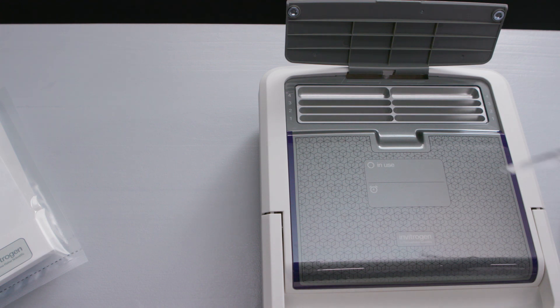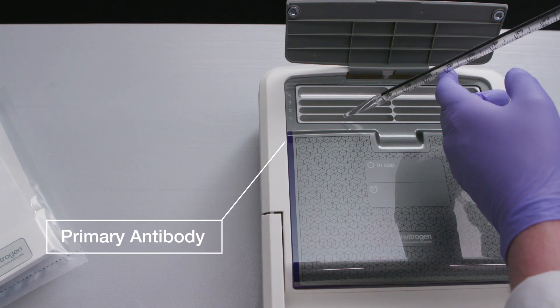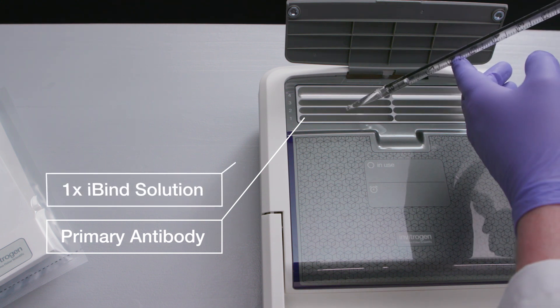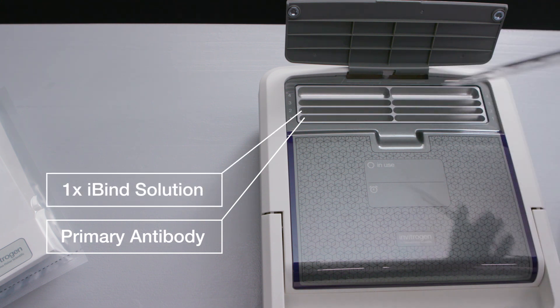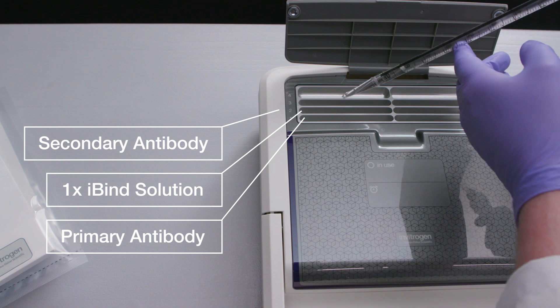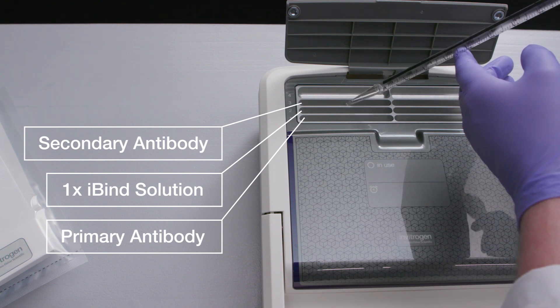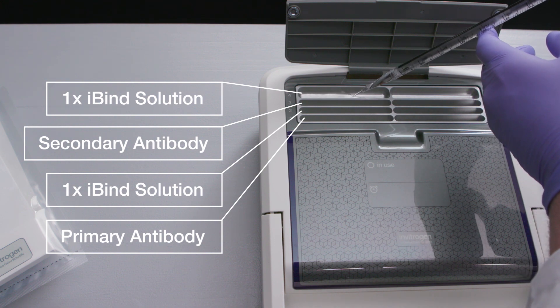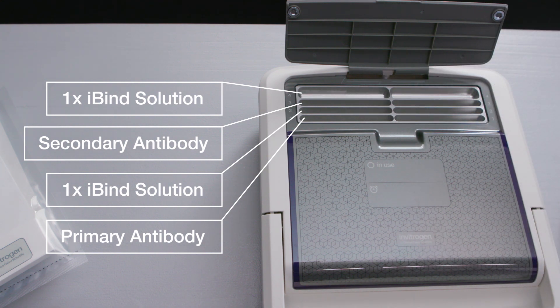Referencing the volumes in the quick reference guide, add your primary antibody to each well of row 1, add 1X iBind solution to each well of row 2, your secondary antibody to each well of row 3, and 1X iBind solution to each well of row 4. For mini and multi strip inserts, each column can be loaded with a different antibody pair.